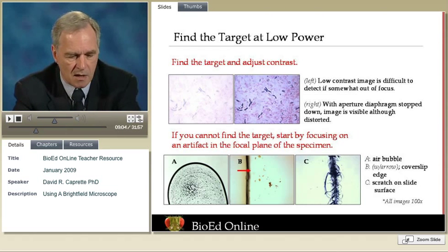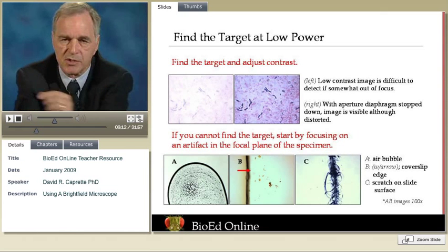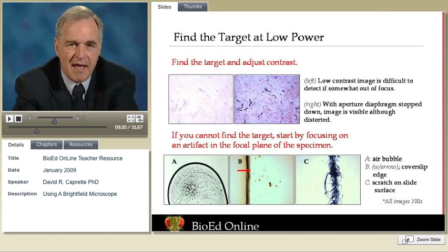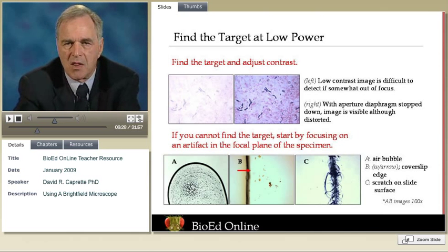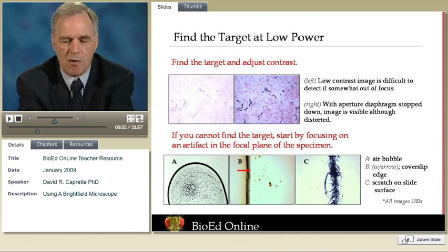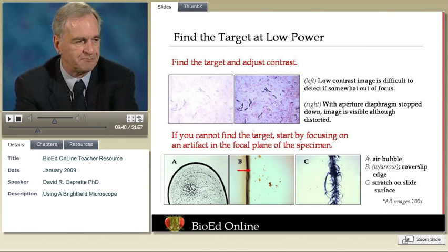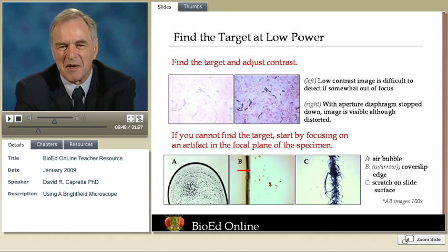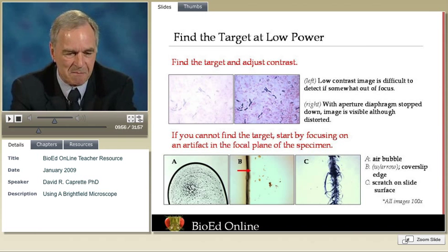Sometimes you can't find the target. Gram-negative bacteria, for example, stain a very light pink. At low power, they might look like dirt on the slide if your aperture diaphragm is stopped way down. Usually you can't see them at all and need to focus on something else. The same is true with living specimens — things that are swimming around, any kind of small object, especially if they're sparsely distributed. We need to get into the focal plane first before we can start searching. One way to do that is to focus on an air bubble. If you have a defective permanent slide mount with a few bubbles or pieces of matter embedded in the medium, you can focus on something of that sort.